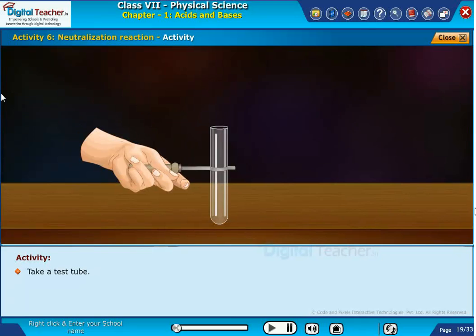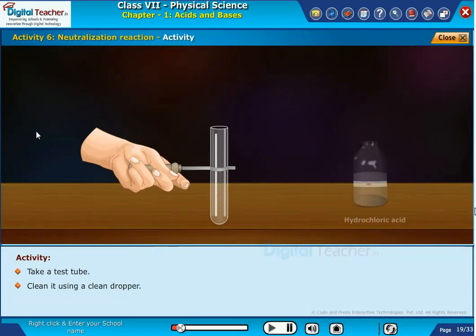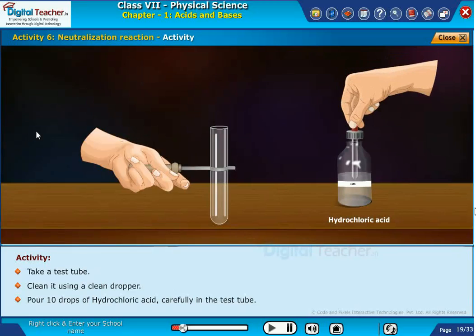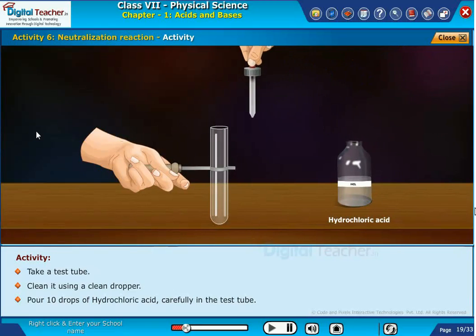Take a test tube and clean it using a clean dropper. Pour 10 drops of hydrochloric acid carefully in the test tube.